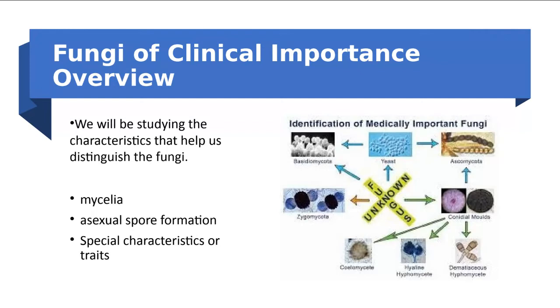Let's go ahead and talk about the fungi. So there are two types of fungi that we're going to be interested in. We're going to be interested in the yeast and the molds. If we're looking at yeast, we're mostly going to be looking at whether or not they bud. Now there are some other things that the yeast do that I'll be able to show you so that you can use them diagnostically.